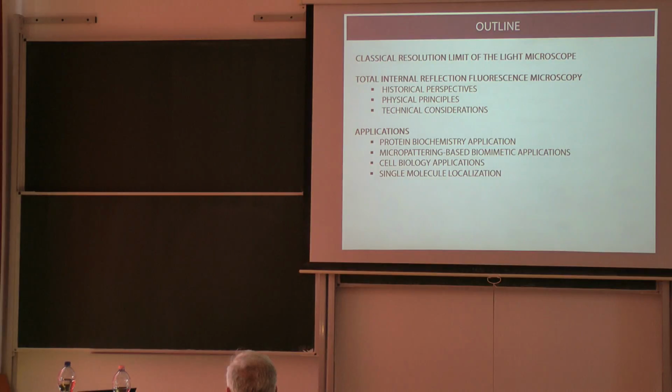And at the end, to illustrate the potential of the technique, I will show you different applications from the fields of protein biochemistry and cell biology, and some special applications related to micropatterning and single molecule localization imaging.